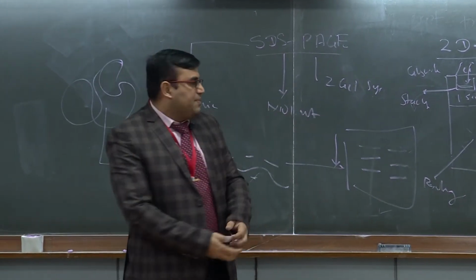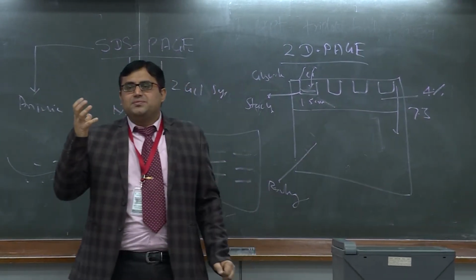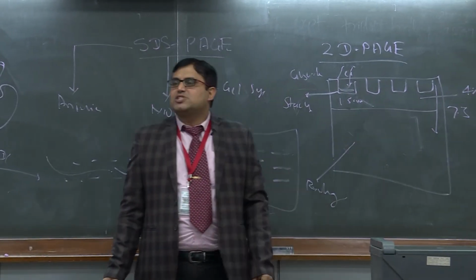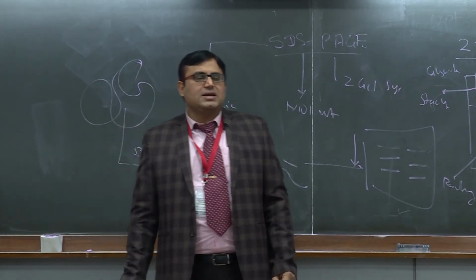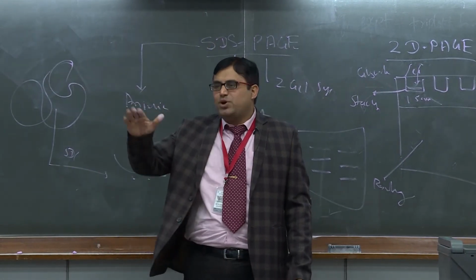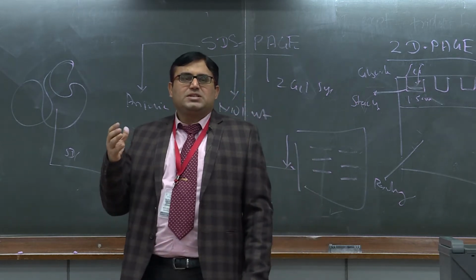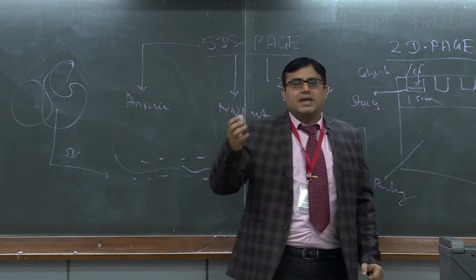Once your protein enters, these ions will charge, and because of the pH of 6.8, this glycinate ion will start giving a dragging force, because the electrophoretic mobility changes at 6.8 pH. It will be almost neutralized, and once it neutralizes, it will show its movement in a dragging way.